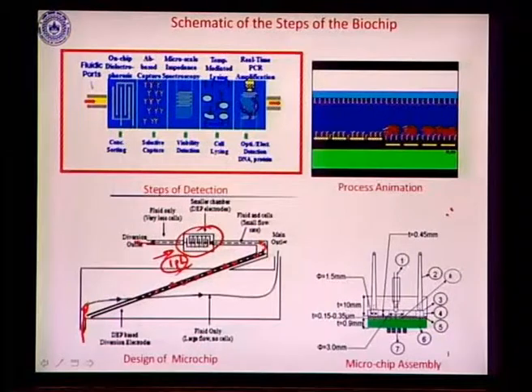So, the sample which is lean in bacteria is flowed out of the solution here, and the retention here is almost found to be close to 90 to 95% because of dielectrophoresis. So, we do not really need to worry about lossy components in this particular microchip situation.